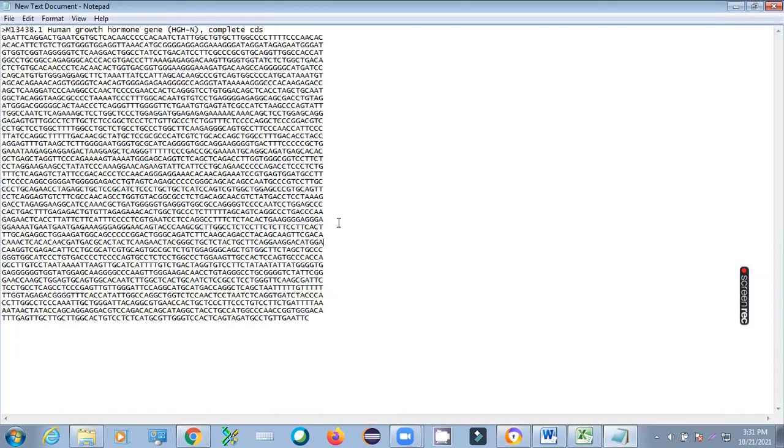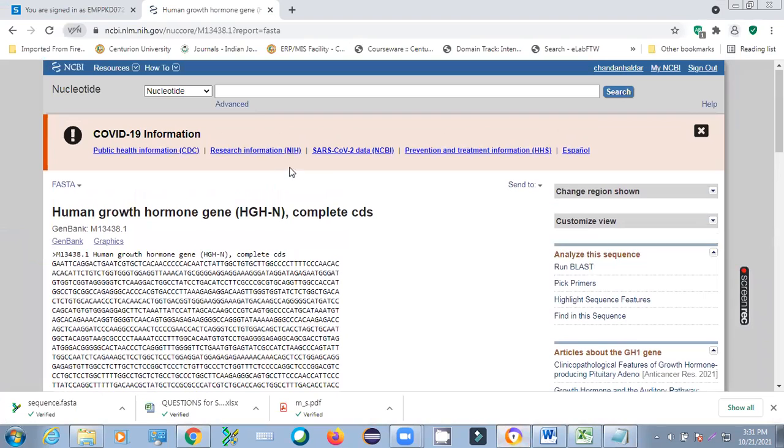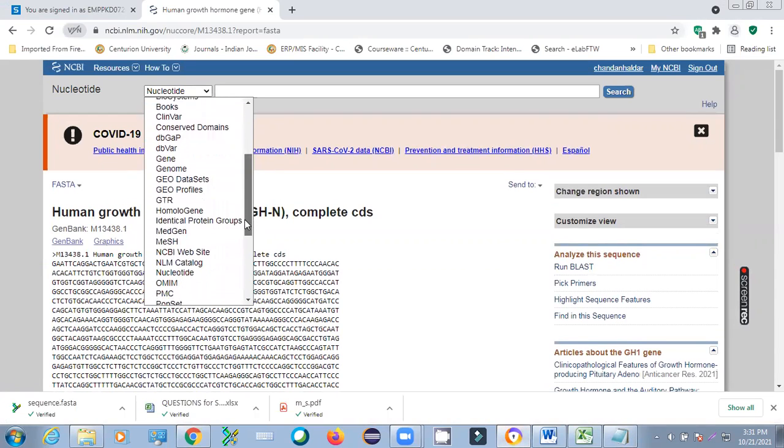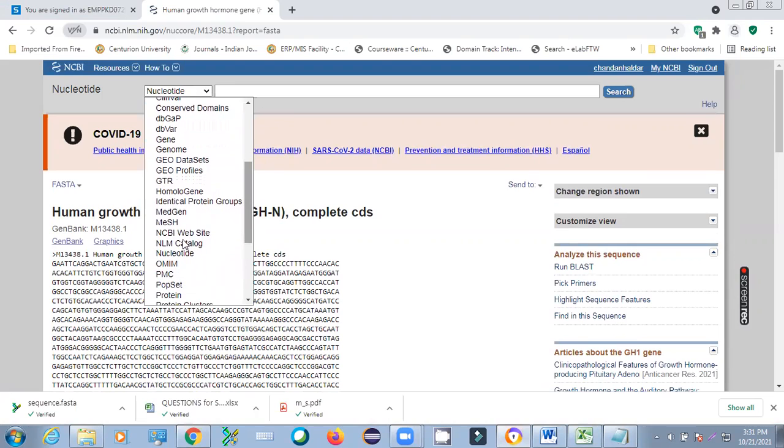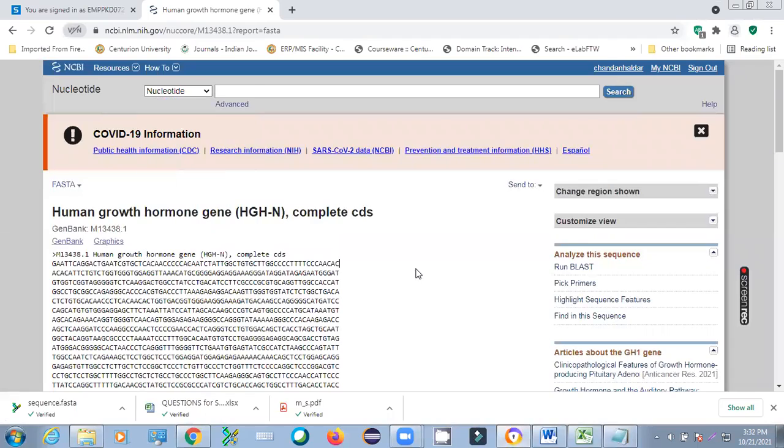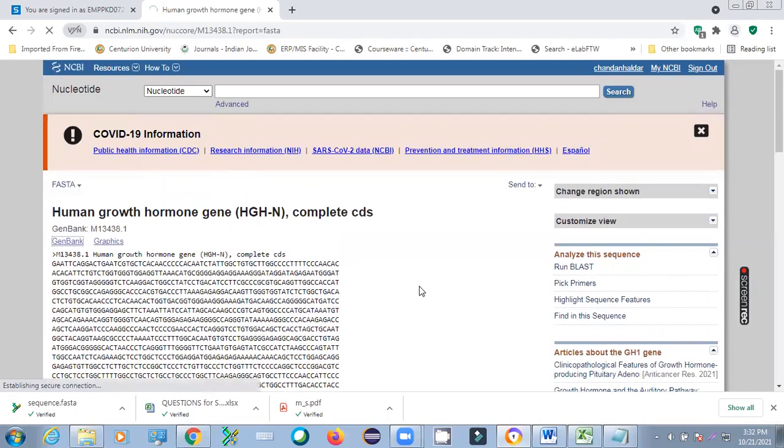So this is the basic I have discussed today about how we can get the nucleotide sequence of any gene from NCBI. That's all for today. Next day we'll discuss how to get the protein sequence. There is nothing different in protein sequence. Instead of using this nucleotide, you can go to the protein sequence directly.